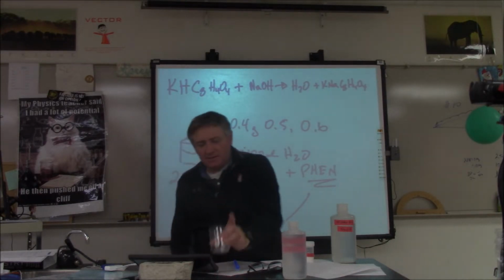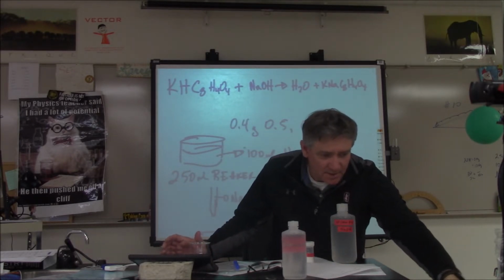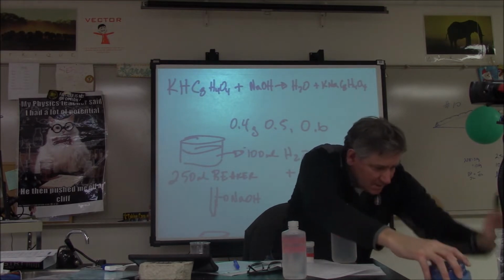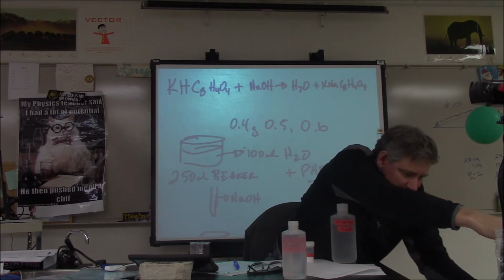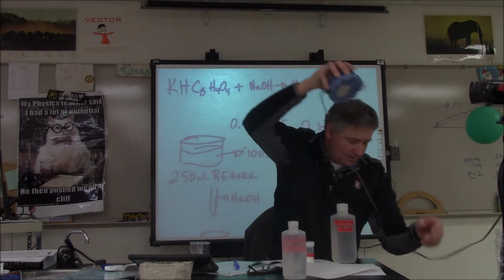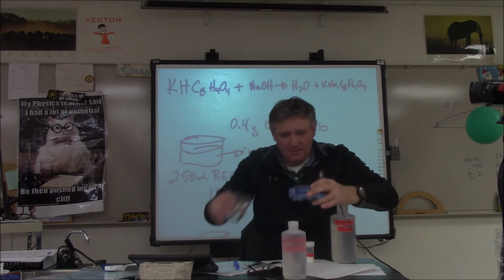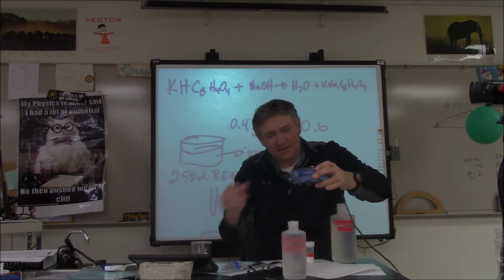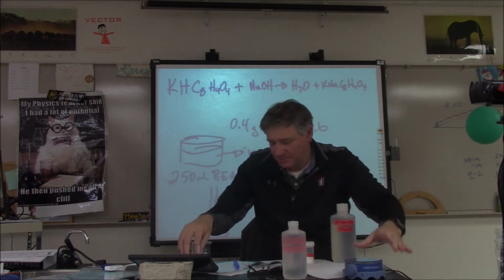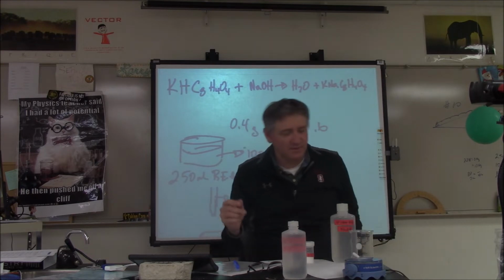And hopefully you all are familiar with these stir bars, okay? They've got a little magnet on them. When you turn them on, they spin. So you're going to put that in here, add your KHP, add the water, and put it on there.